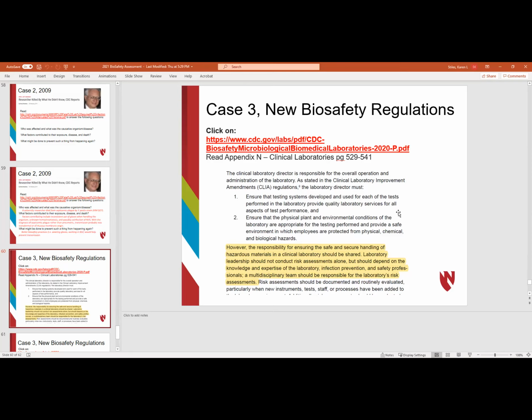But when it comes to considering the biosafety levels, obviously, you have to think about doing what we call risk assessment. Well, in the past, the risk assessment was just left up to the laboratory manager. Nowadays, that is not true. So CLIA coming through, CAP coming through, COLA coming through, any of those accrediting agencies may ask to see your guidelines or your paperwork in doing a risk assessment.